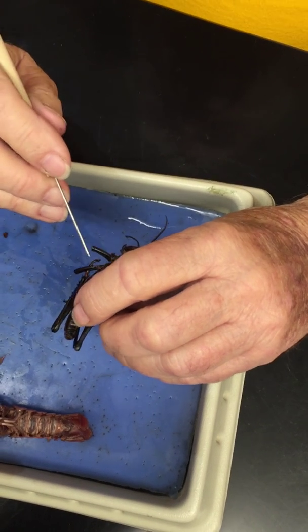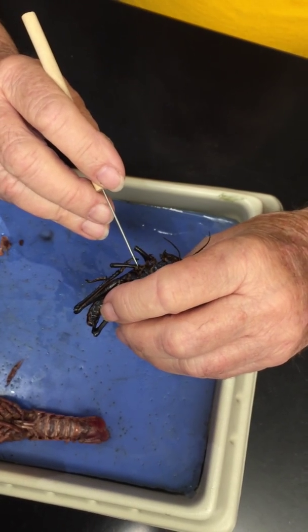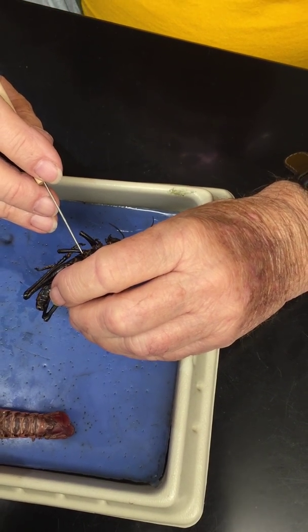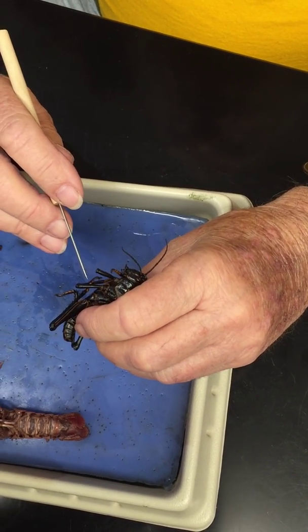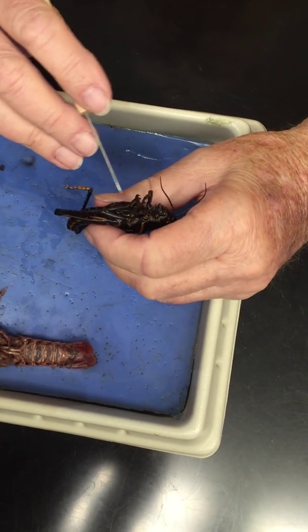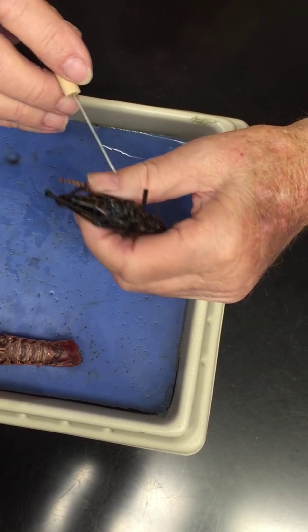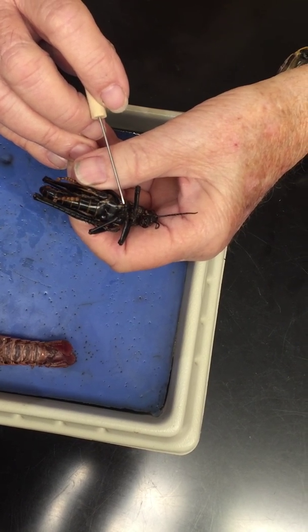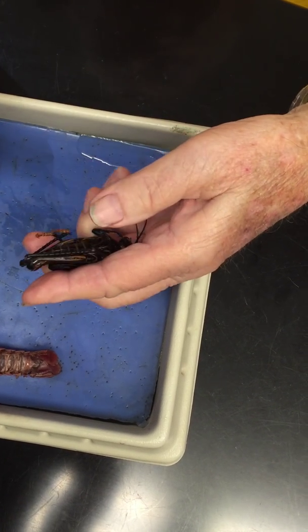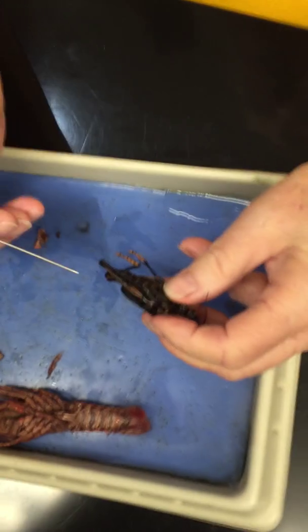Now, the basic portion here, oh, there's a good one. You see, there's the coxa. Is that right? Okay. And after the coxa is the trochanter. Now, the trochanter and the femur are fused, even in the forelegs. This is the tibia. Those are the tarsus. Here are the tarsal claws, and that's the pulvillus on the end of it. That's the pad.